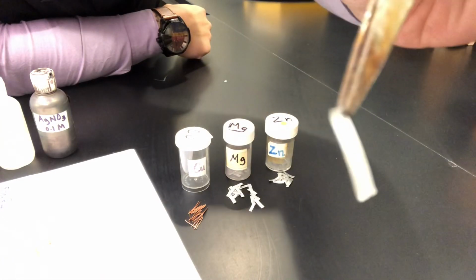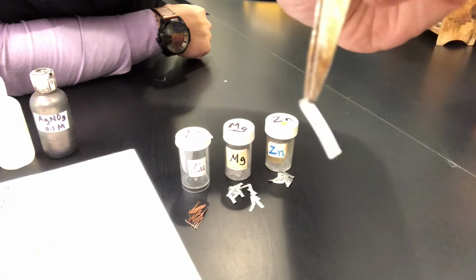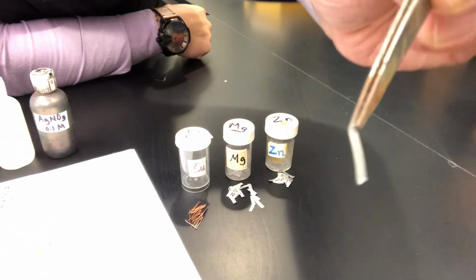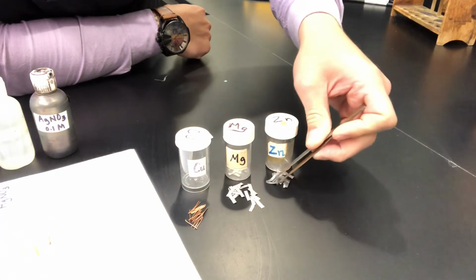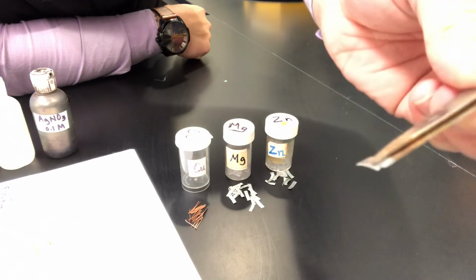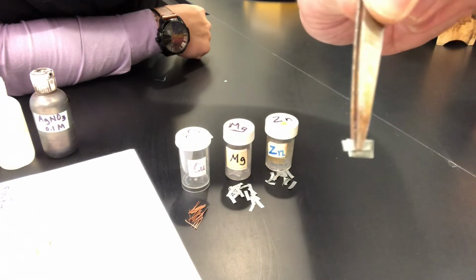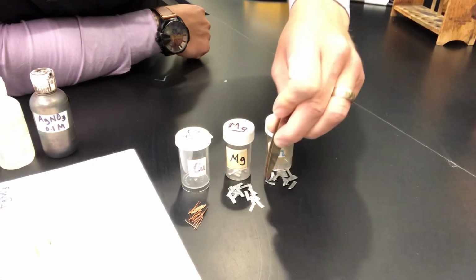Magnesium has a silver color to it, a little bit of luster, not as much shine as zinc, but has a little bit of luster to it and is malleable as well. Go ahead and take that observation. And then zinc metal as well. We have a little zinc ribbon. It's lustrous, so it has a shine to it. It has a silver color, and it's also malleable and bendable.